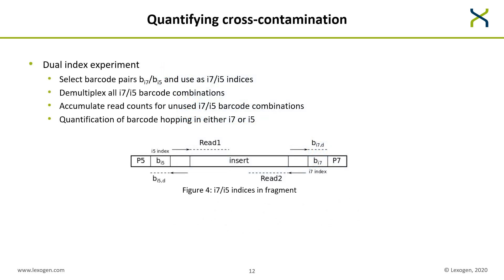To quantify the cross-contamination achievable with our barcodes, we performed dual index experiments. In a dual index experiment, one selects barcode pairs P7 and P5 and uses them as I7 and I5 indices. A sequenced fragment is flanked by the P5 and P7 adapters followed by the I5 and I7 indices chosen from our barcode set. We demultiplex with respect to all barcode combinations — not just the ones used in the experiment — and accumulate read counts for unexpected I7 and I5 barcode combinations. This tells us how often one barcode changes into another, the phenomenon called barcode hopping.